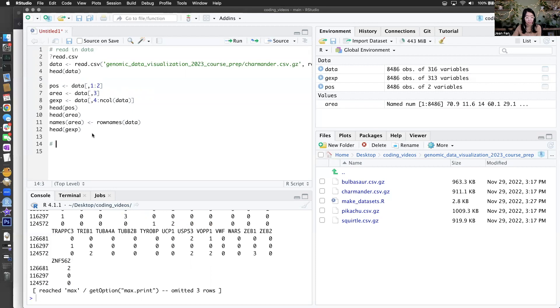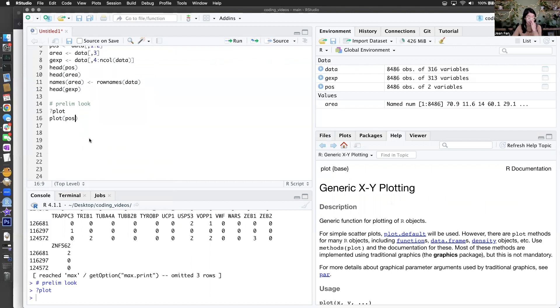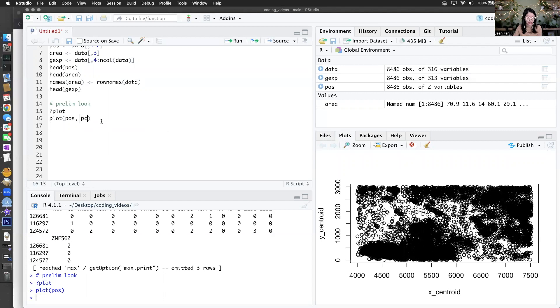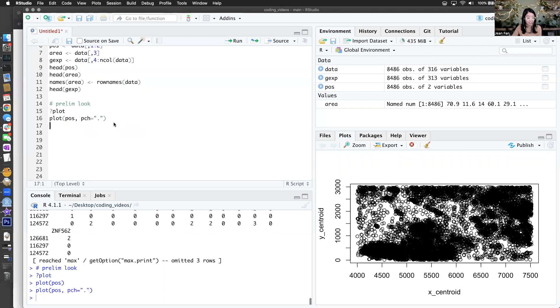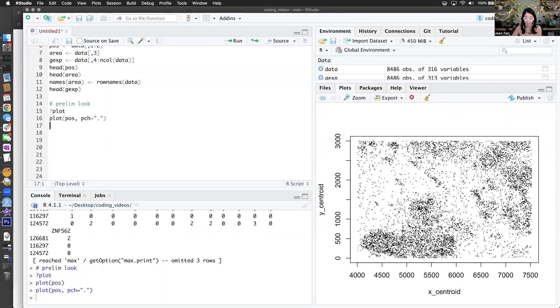Before we do any serious data analysis, let's just take a preliminary look at what the data looks like. We can use the plot function, which is part of base R. The students will be learning how to use ggplot also, but I want to at least make sure that we can plot things in base and have everything make sense. I'm going to use a different pch so that I can have little dots instead of circles. Already you can see some interesting variation in terms of cell density — each point is the centroid of a cell, and they're denser here and more sparse here.